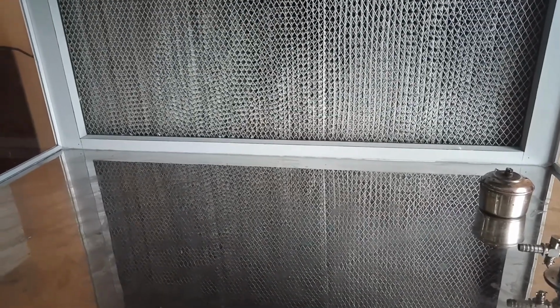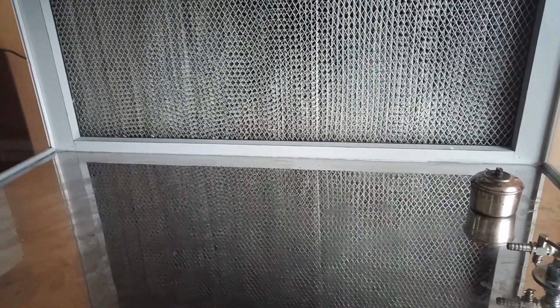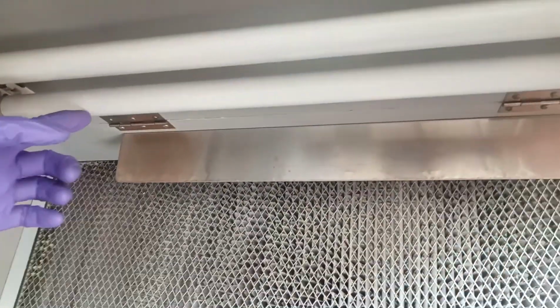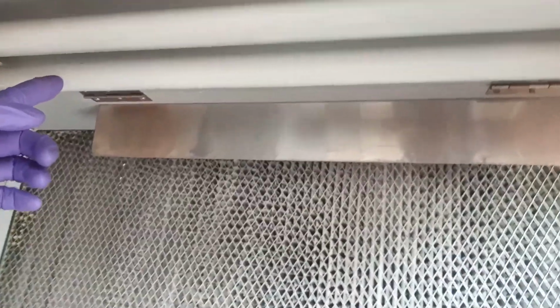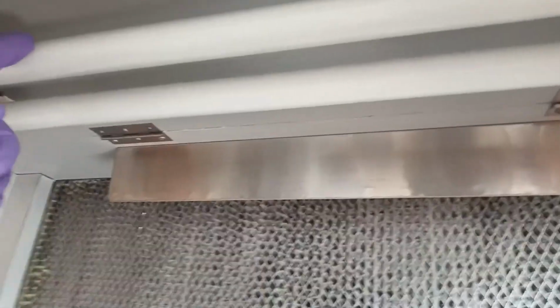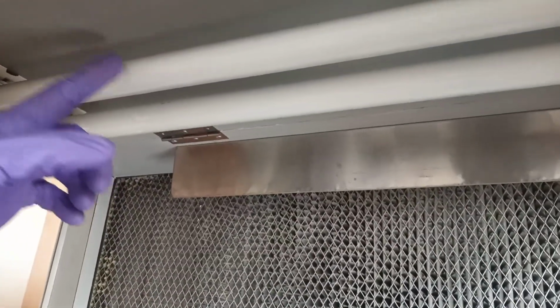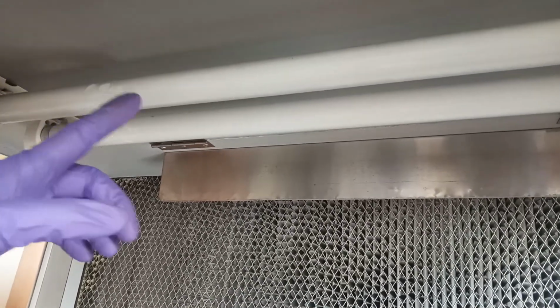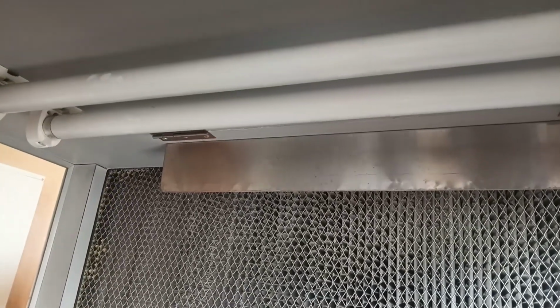To ensure that, at the beginning we need to sterilize the entire hood. For that we have a tube. If we look on top here, we have a UV tube and also one tube that is the working tube, a normal tube that helps us during functioning. This is the UV tube that is switched on before starting the work inside the laminar hood, and this UV radiation kills all the microorganisms present inside the hood. And there will be a blower.